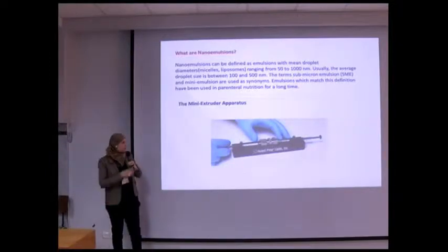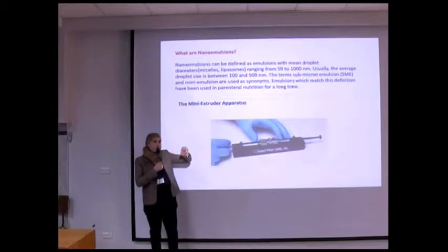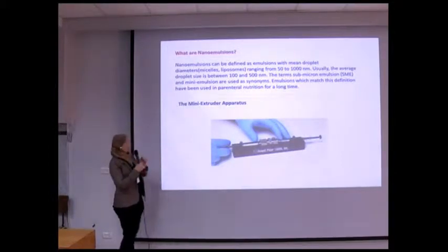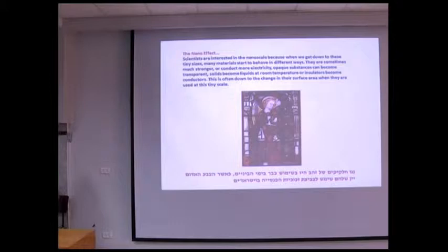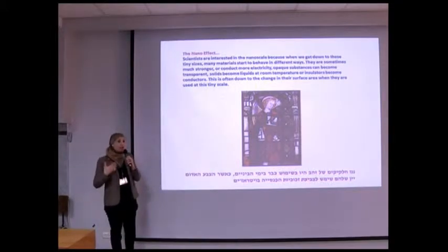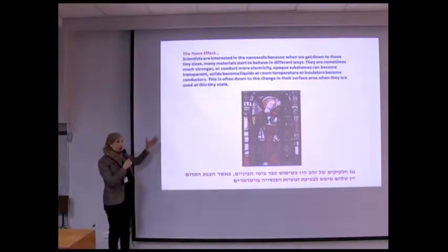The answer is yes, because with this simple apparatus, which is very simple to use and also very cheap, we have just to move the solution across a membrane several times, and we get a nanoemulsion. Okay? So in the first step, we could do this. And why is it important for the students? Because we want to let the students test slightly what nanotechnology means, what nanomaterials mean, and what is important.